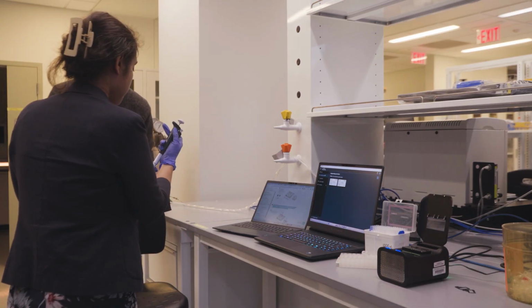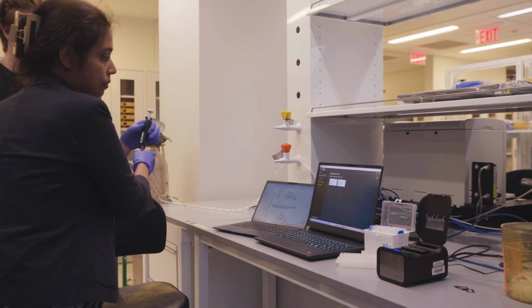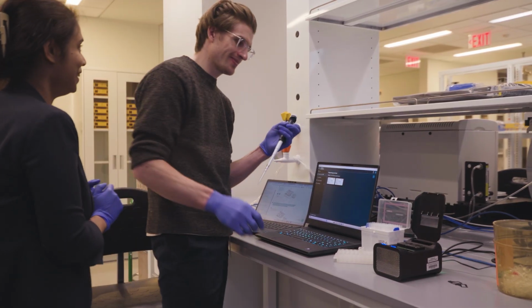Oh, so you really need this type of pipette then? Yeah. You can't have a walk-in one? No.